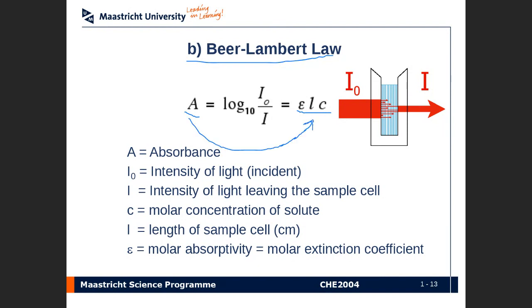So the simple way of understanding the Beer-Lambert law is just that A, absorbance, equals epsilon L C. But you can think of absorption in terms of this logarithmic relationship, base 10, which is essentially nothing more than the ratio of incoming radiation, I subscript 0, versus the radiation that manages to pass through, expressed in a logarithmic fashion, okay?